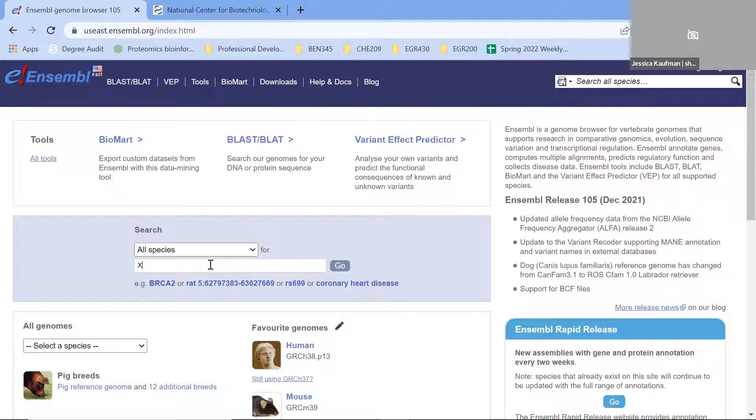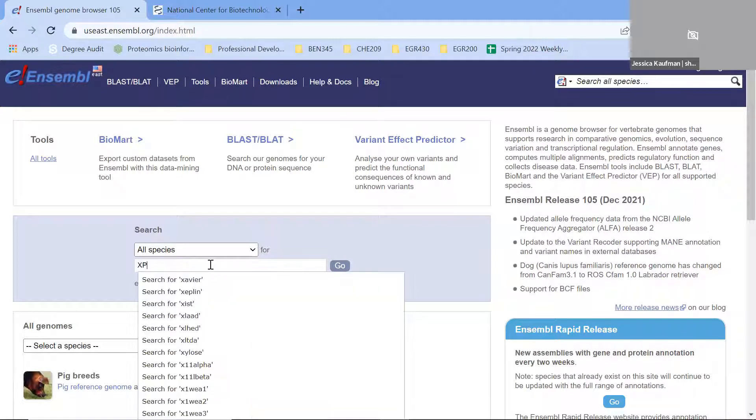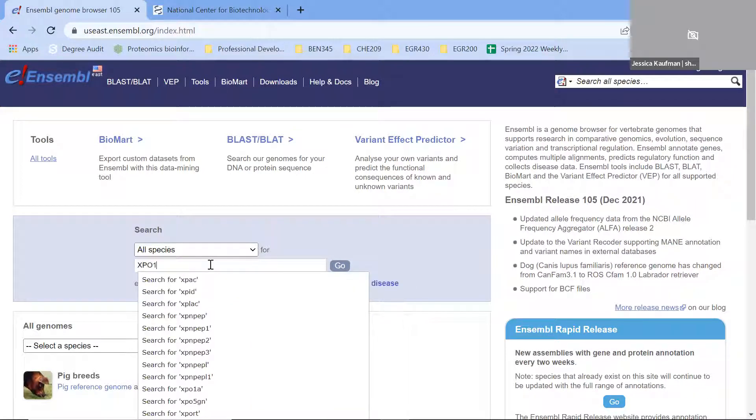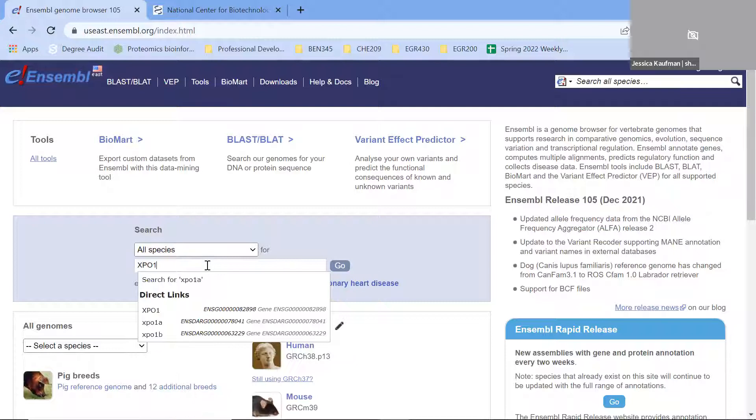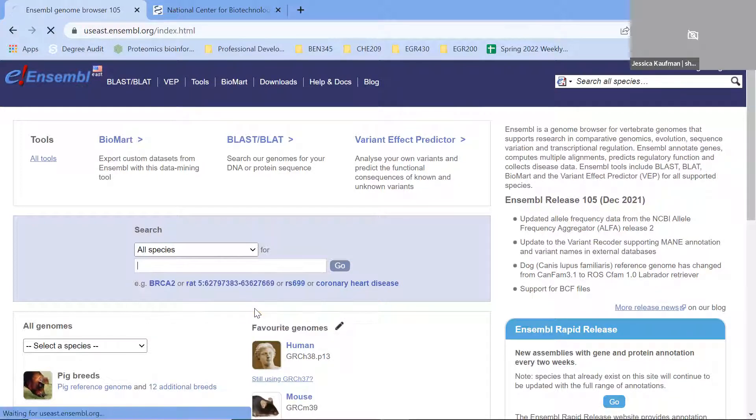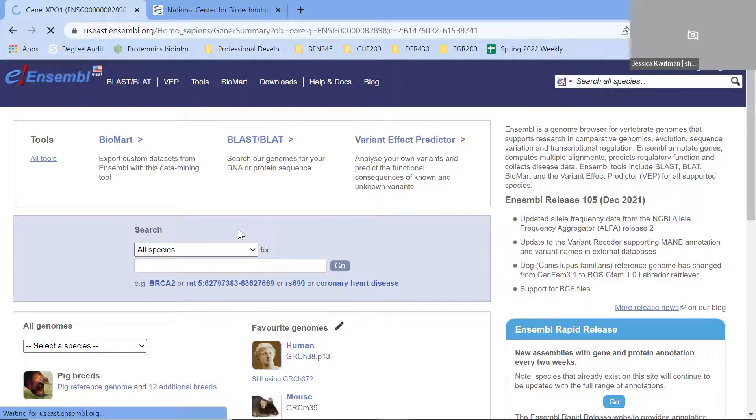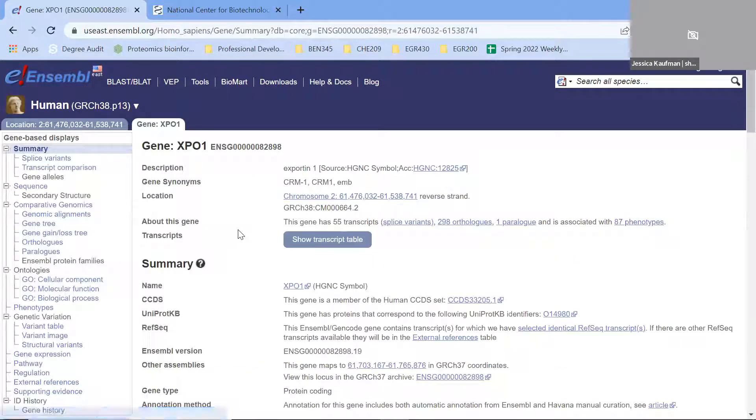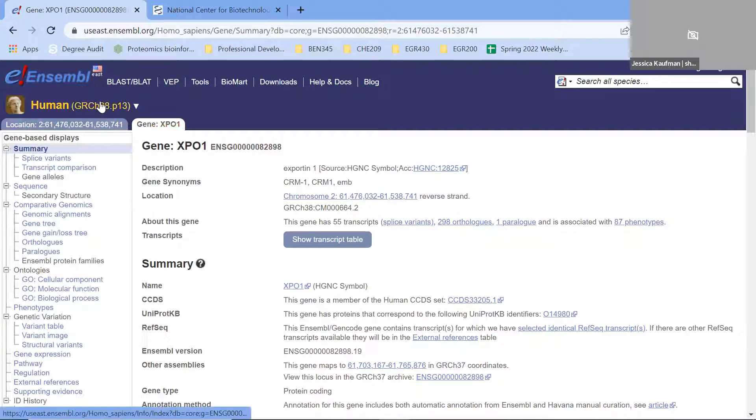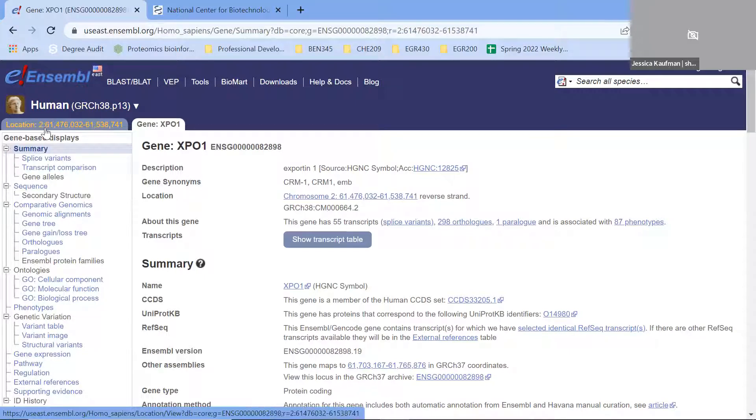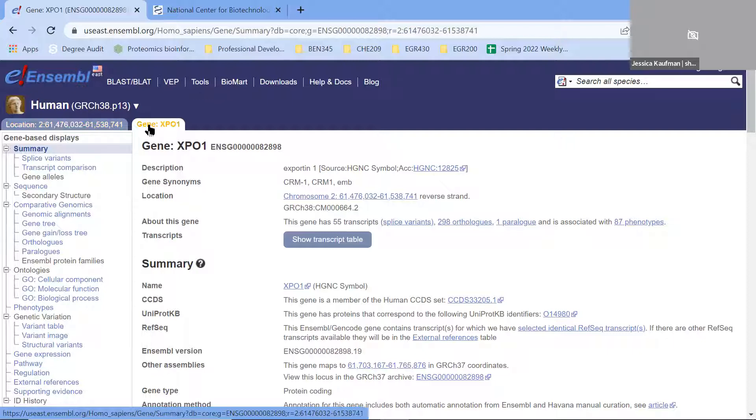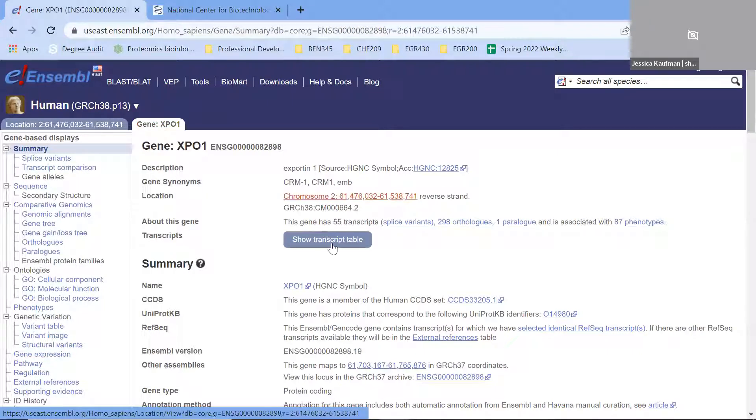I'm going to start on Ensembl by looking up the XPO1 gene in the human genome. Once I open the gene page, we're going to see that Ensembl organizes the information with multiple tabs. I can look at the genome level, the chromosomal location on chromosome 2, neighboring genes, and what transcripts this gene makes.